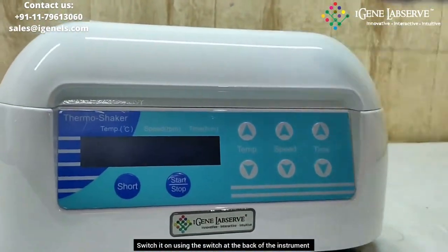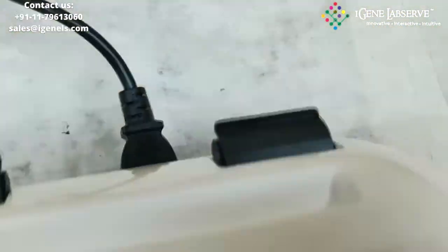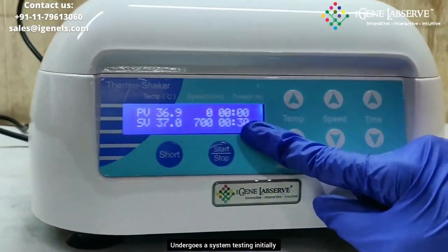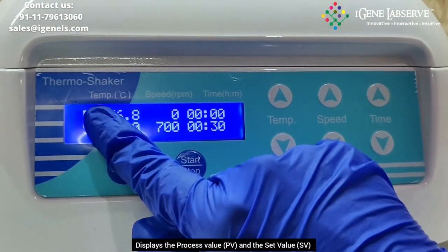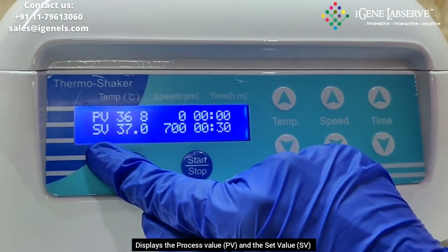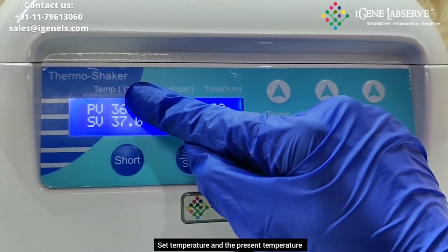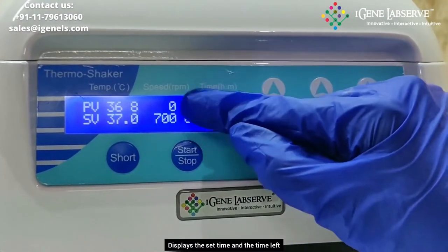To turn the machine on, you have to switch it on from the back side. It undergoes a system testing initially, and then this is the main display. It displays the PV, which is the process value, and the SV, which is the set value — for temperature, RPM, and time.